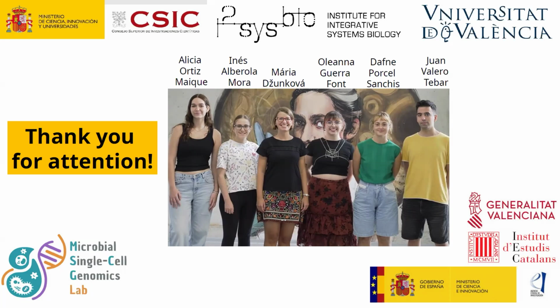Yeah, so definitely. There are two ways this can be done, depending on who the host is. In the first instance, maybe you can do something very simple, depending on whether your host cells are large enough and your bacterial cells are the typical bacterial size. You can just do some filtering with 5 micron filters. This will at least remove some portion of the host. And then with this prep of cells, you can go to a flow cytometer and maybe refine your sorting, because the Atrandi kit recommends to start with 62,500 cells. So you have to have this number, and trying to enrich by size sorting for your bacterial cells will also be an option before you start with the barcoding.